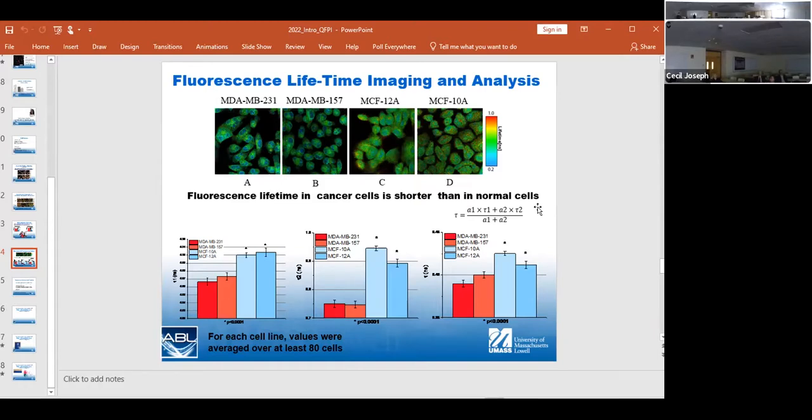One of the things we're working on and still analyzing is imaging and analysis of the breast FNAs. We have performed some preliminary analysis of the fluorescence polarization versus the grade of the tumor and have found some interesting results. There may be a correlation of higher fluorescence polarization in grade 2 versus grade 1, and we are looking at that.